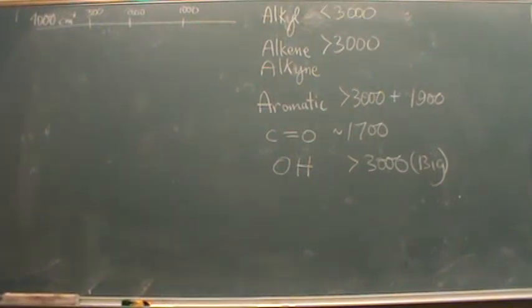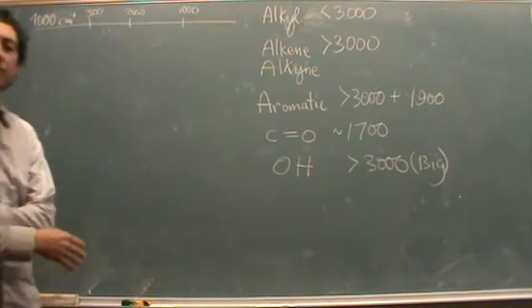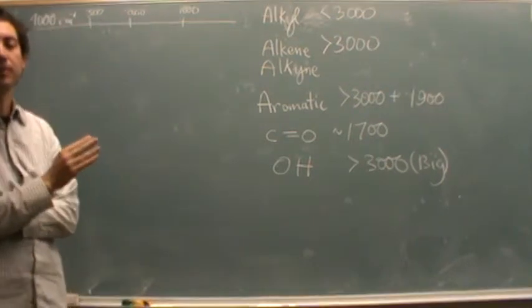I'm going to say a little bit about IR right now. I'm going to give you the basics of it. I'm not going to explain the theory behind IR. I just want to explain some of the peaks.